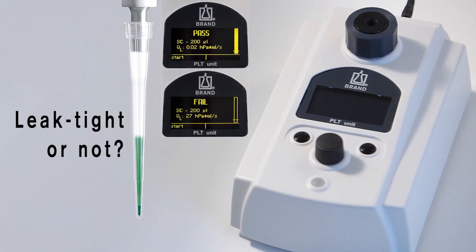The PLT unit from BRAND finds even the smallest leaks in just seconds and compares the missing volume with the tolerances in the ISO standard.